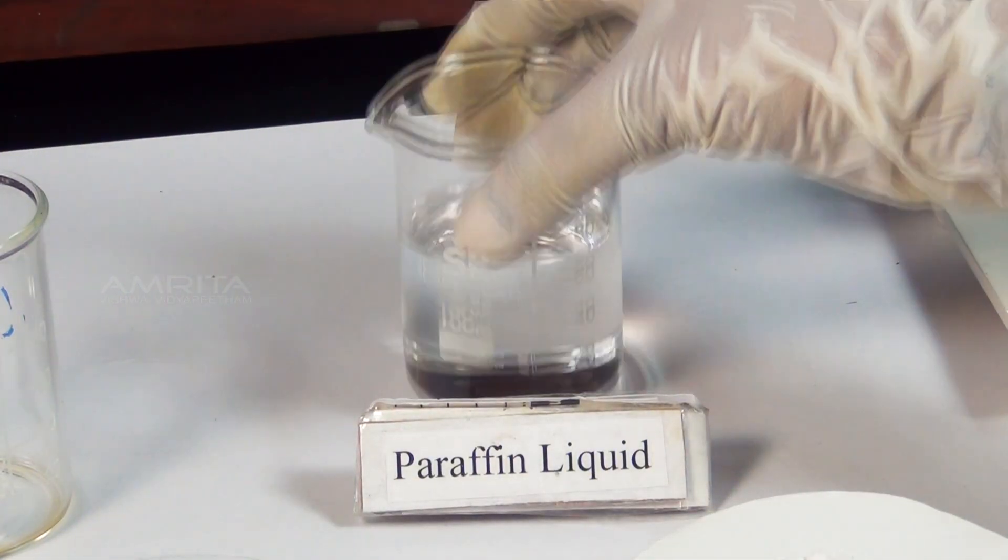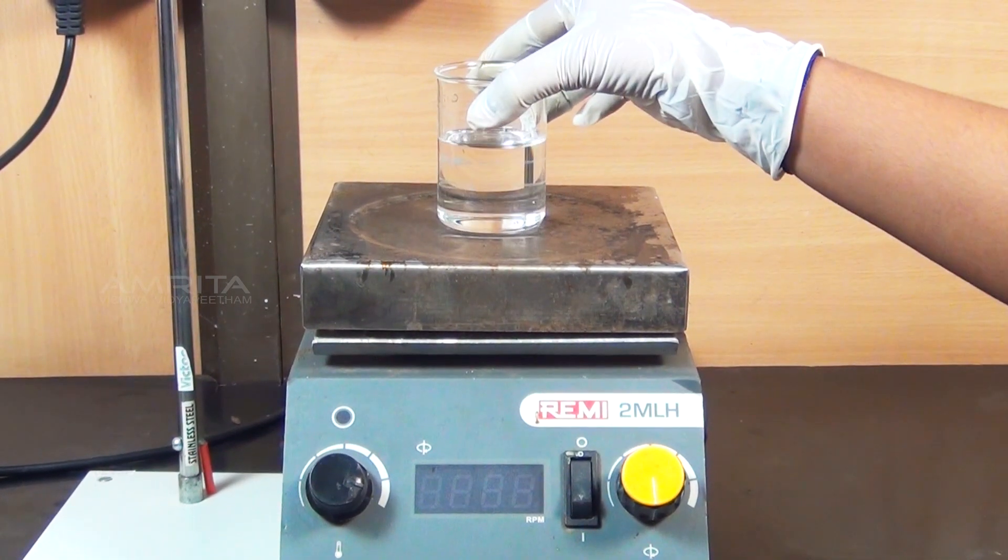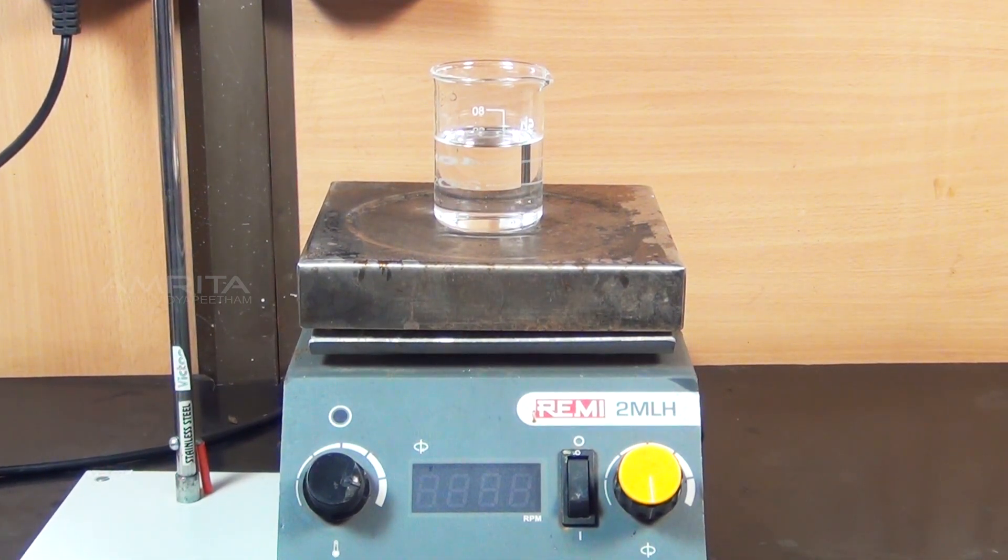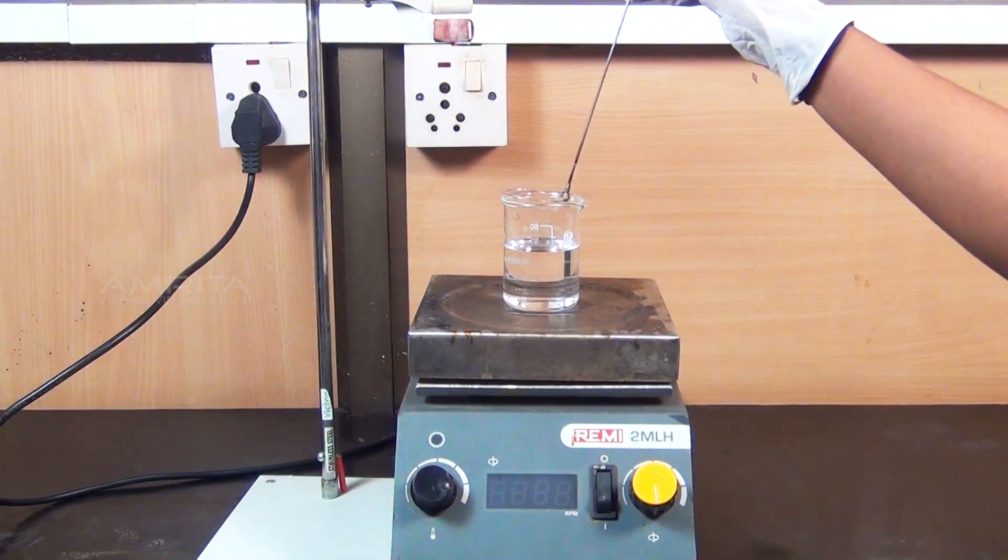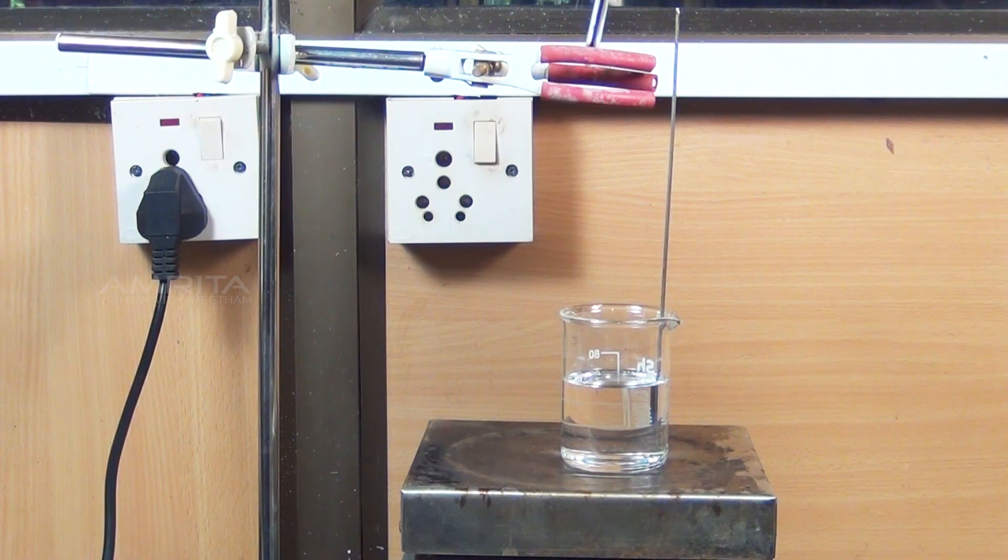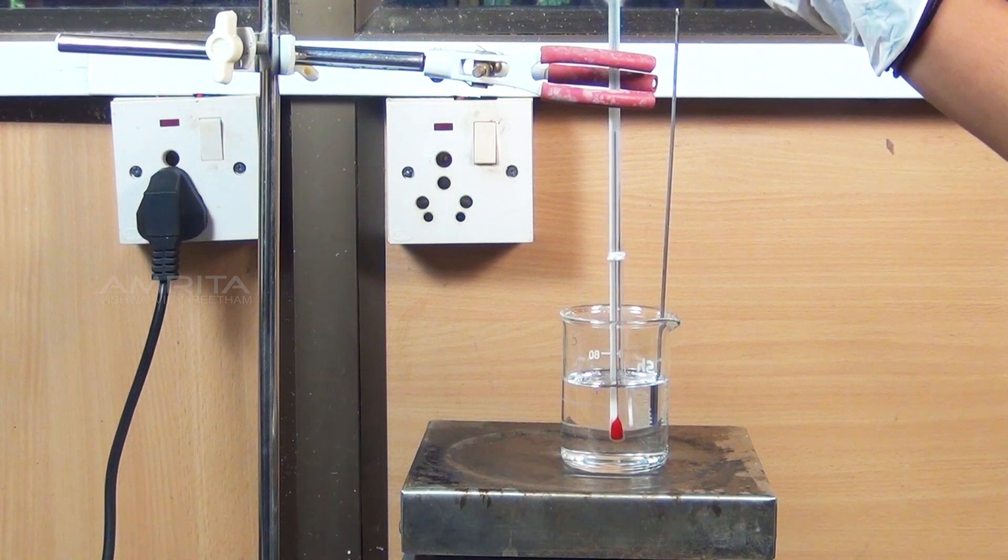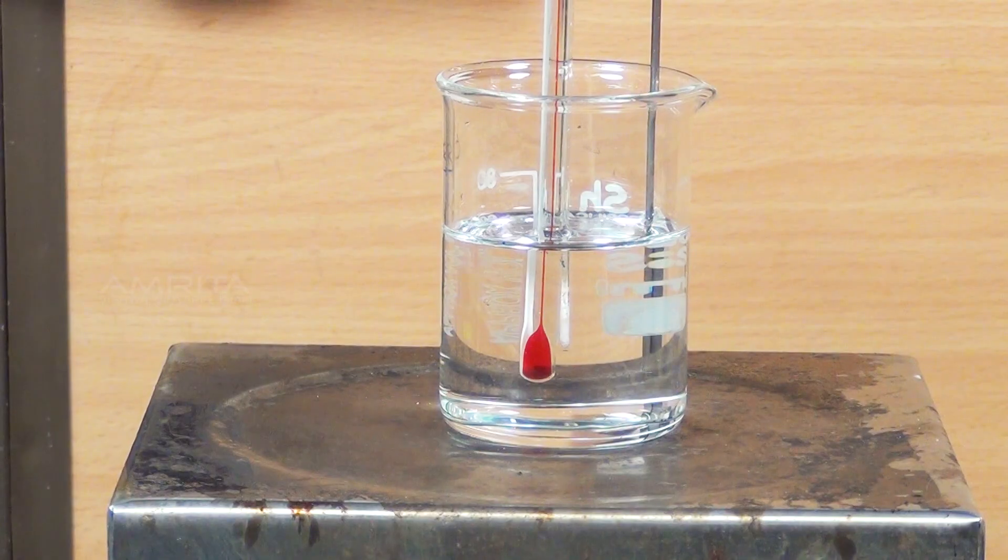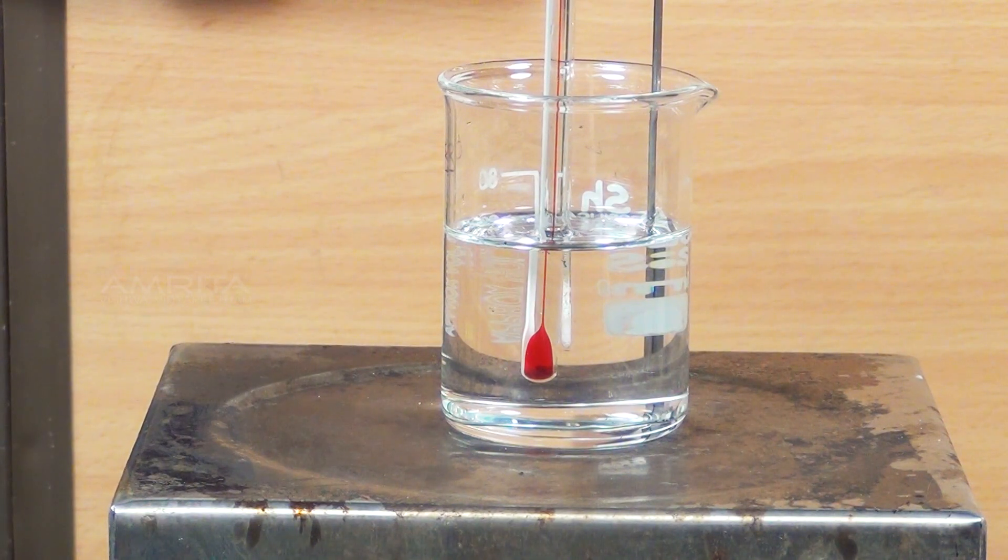Take the 100ml beaker containing liquid paraffin and place it over the hot plate. Insert the stirrer in the liquid paraffin bath. Clamp the thermometer carrying the capillary tube to the iron stand and immerse them in the bath of the liquid paraffin.